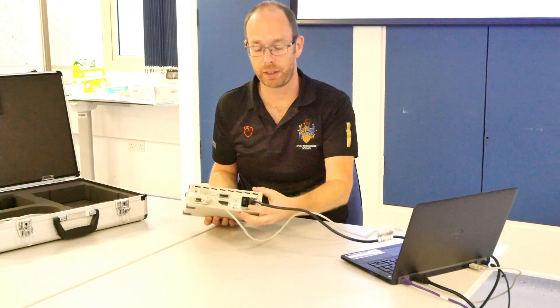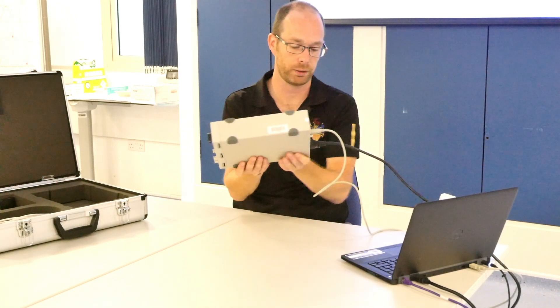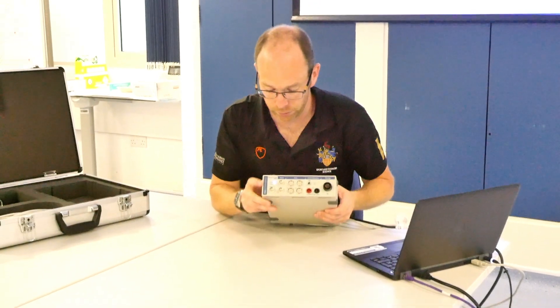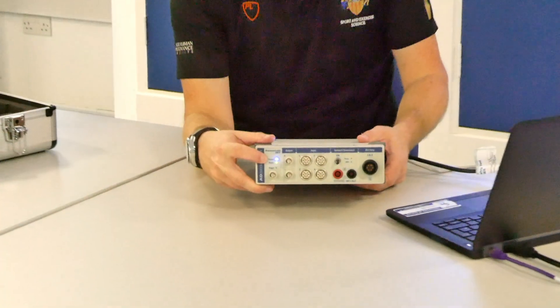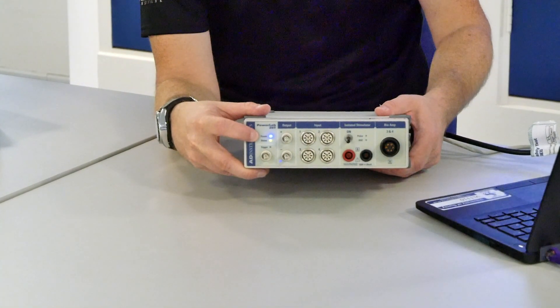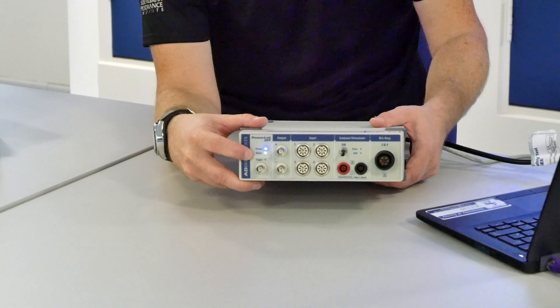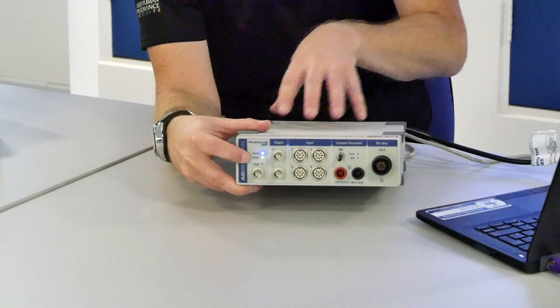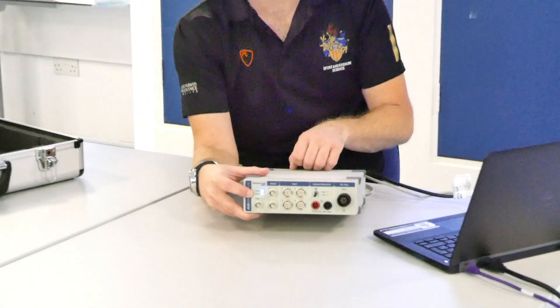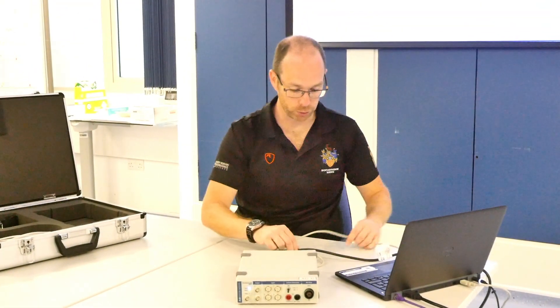Once you've plugged everything in, remember to switch on the machine. When you turn it round you will see the blue power light and either an orange or a green light. When the status light flashes orange then there's something wrong and you may need to reconnect your leads. In this case it's green, so we know it's good to go.